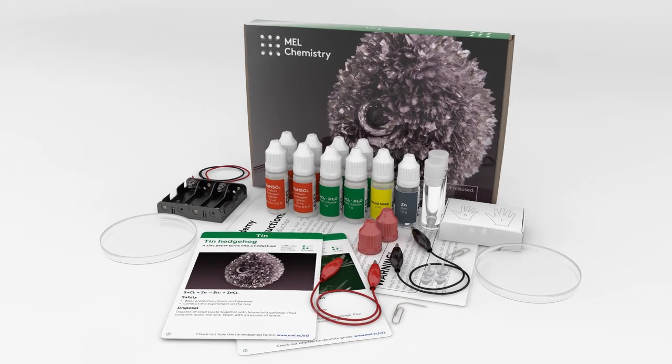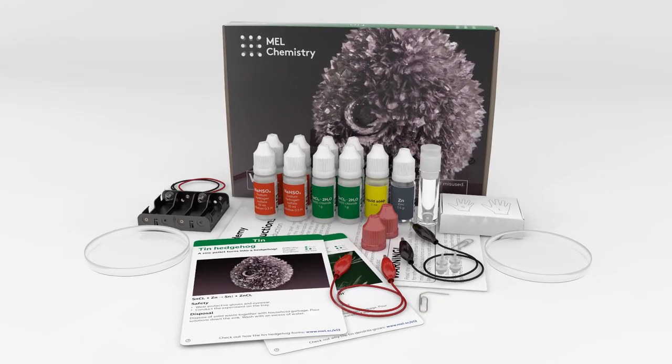Welcome to the wonderful world of chemistry. Today, with the help of the tin set by Mel Chemistry, we will grow a tin dendrite.